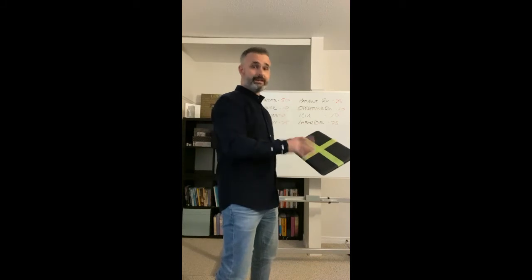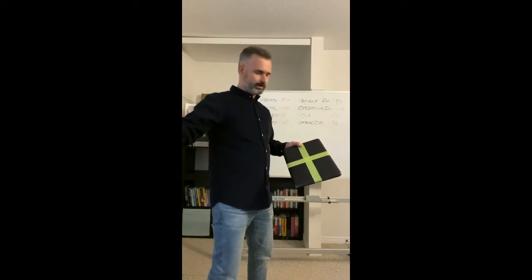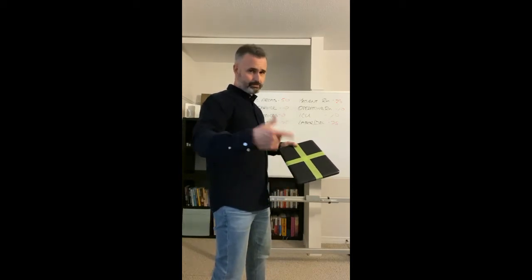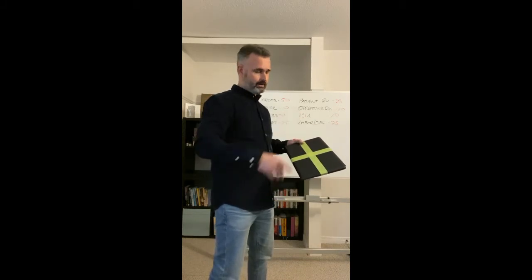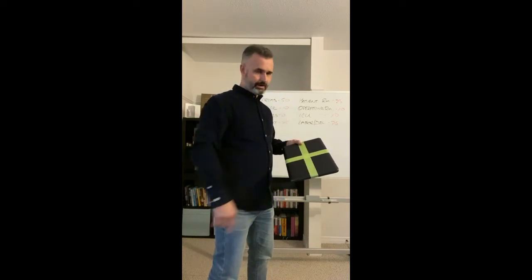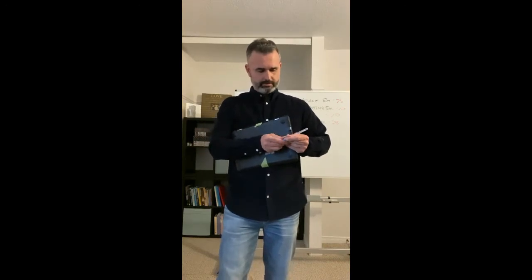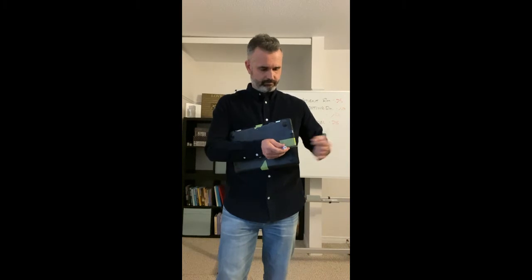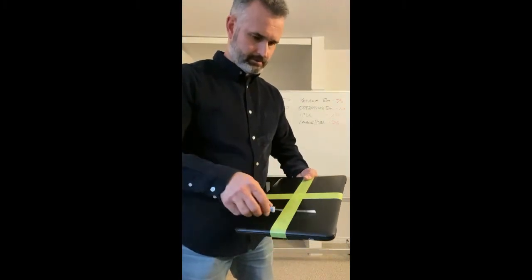Anyways, okay. So what we'll do now, I'll be honest, ideally what we would do is do a test first on each of these surfaces and then obviously do the procedure. But we're waiting like 30 seconds between each of those. So we're going to swab all of this together. We'll get a reading, and then we'll go through the scope after that. We'll open a new swab, and we'll go across all these surfaces.